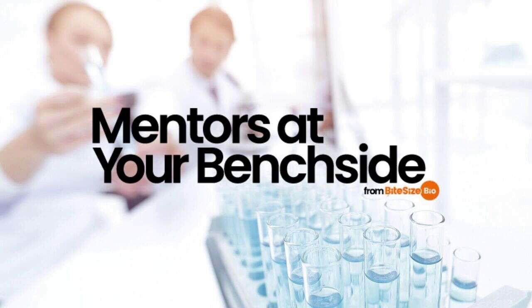What causes low plasmid yields? We received a question from Bite-Sized Bio reader Sonia, asking what could be the problem when one sample gives a good yield while the other plasmid gives a poor one, when both samples are processed simultaneously and in the same way? This is a good question, because many things can cause differences in yields between plasmid preps. Let's resolve this mystery one point at a time and go over some of the reasons why you might get low yields when you perform plasmid preps and what you can do about it.